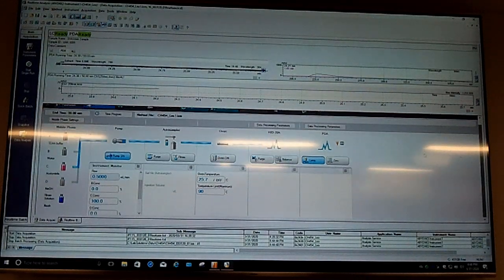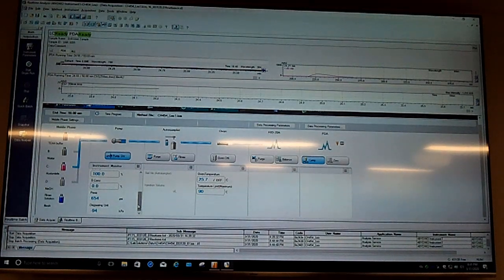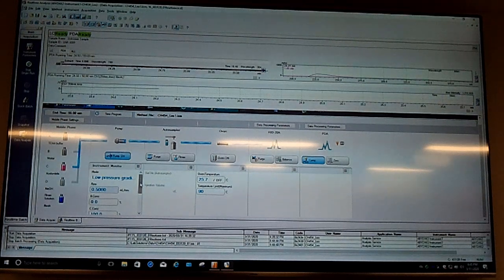The second thing, normally, is you need to wash the column with some acetonitrile or methanol to remove all the residue before you turn it off. That's a little bit to keep in mind, so you don't keep the acidic solution or acidic phase in the column, which is no good for the lifetime of your column. But if you continue to run the next day, that's no big issue.